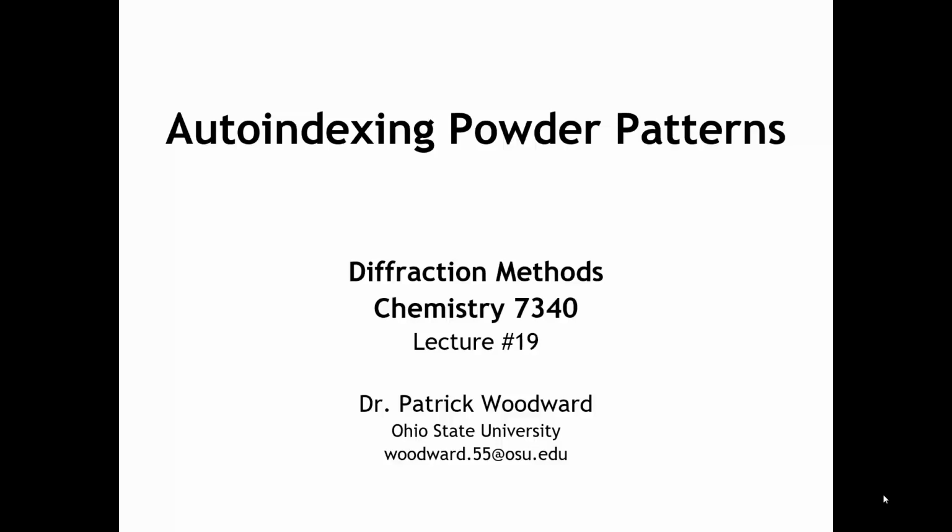I do want to say that this is really an important skill. When you have a powder diffraction pattern, if you cannot index it, you're completely stuck, and you really can't get very much information from your diffraction pattern.